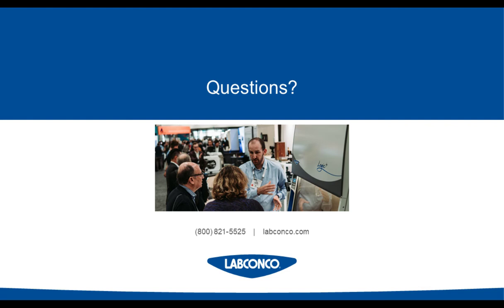Thank you for that. And I want to thank our audience members again for their great questions coming in. David, since there is a glass shield, is there any need or requirement for the clinical laboratory technologist to wear eye protection while performing work in a BSC?